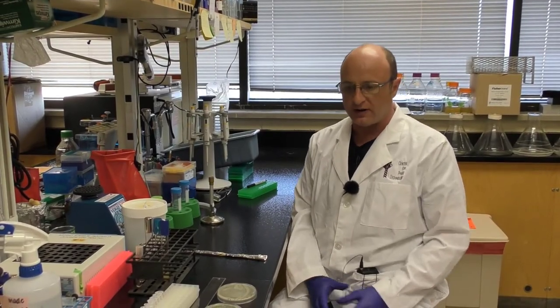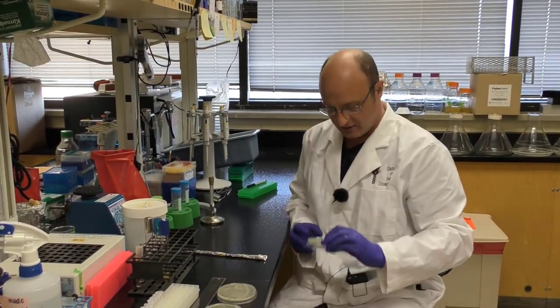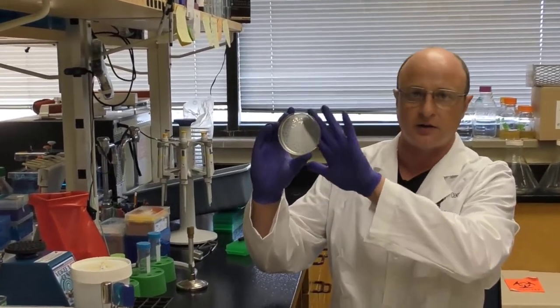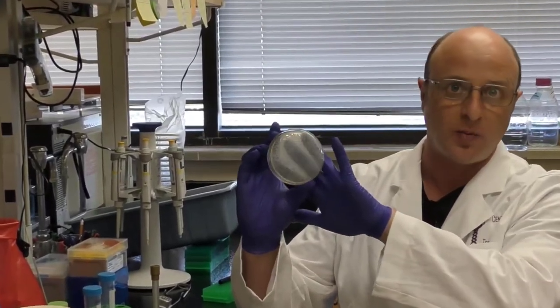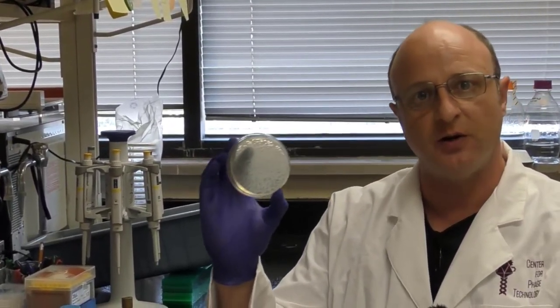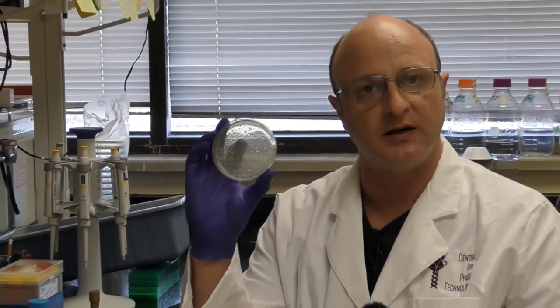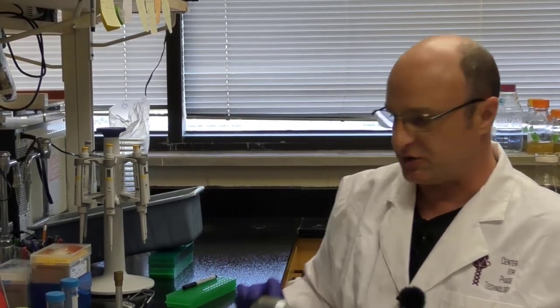So after incubation, the HTL plate should be ready. If you see a plate that's looking something a little bit like this one I showed you earlier, where you can see that there's a lot of plaques on the plate, even more plaques than this, it's probably too low PFU added to the plate. You do want to see something a little bit more like either one of these two plates. And we'll use this one for the actual extraction because this one has the least number of phages added to it that's given us confluent lysis, as mentioned earlier.